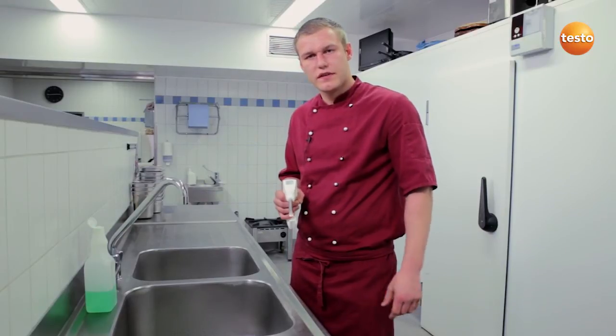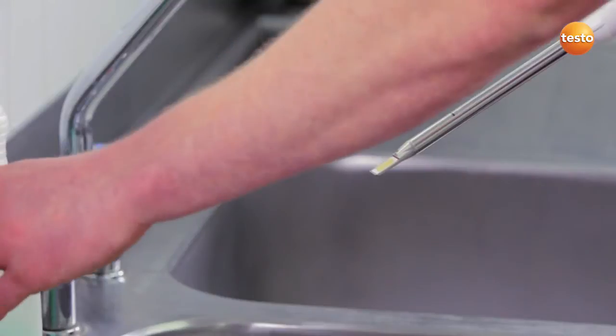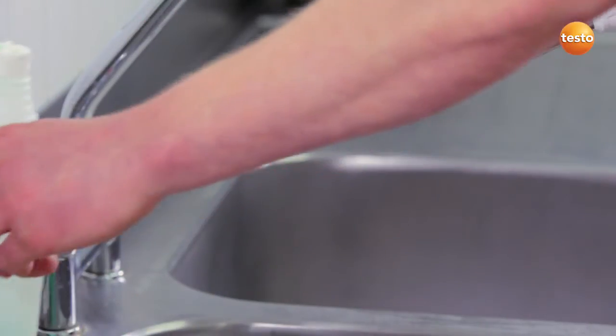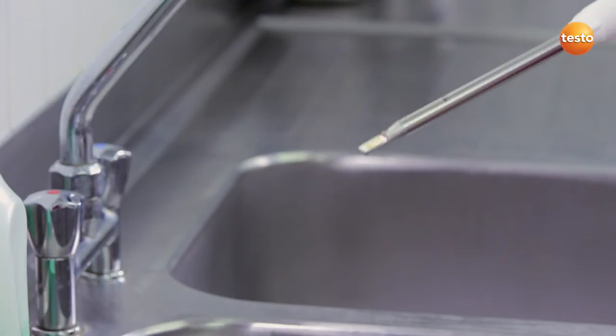Because the Testo 270 is splash-proof, it's no problem to hold it under running water. To clean it, it's enough to clean the sensor under running water with a mild detergent. It's important not to use any aggressive cleaning products or abrasive sponges.